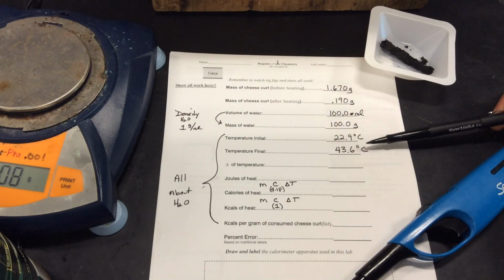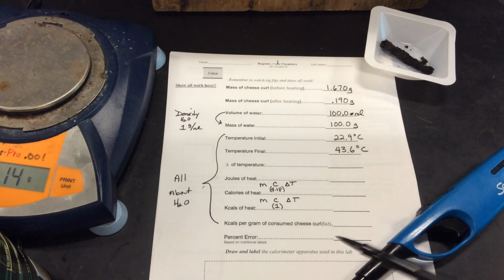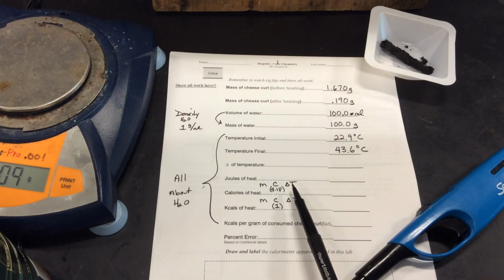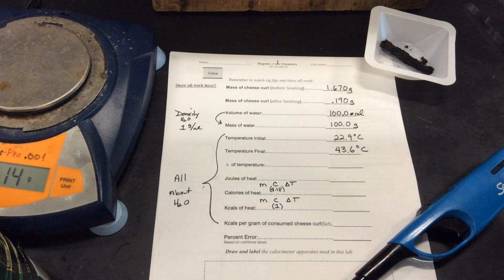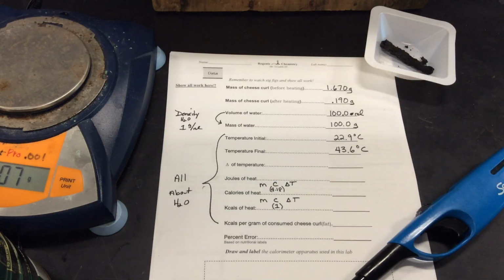So my temperature change, of course, is the difference. To get the joules of heat, I take the mass of my water, specific heat of the water, change in temperature of the water. Why? Because the Q of the water, the energy absorbed by the water, equals the Q of the what? Cheeto that burned. We can't measure the Cheeto directly. Why? Look at it. We needed specific heat. It was changing during the process. We need its before and after temperature. Can't do it. So it's all about the H2O and calorimetry.